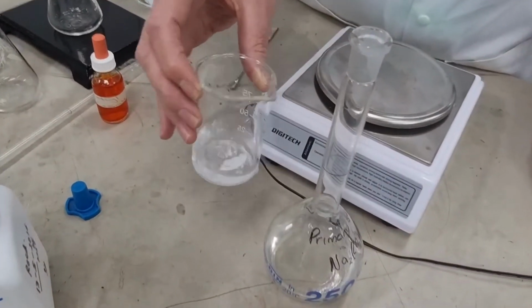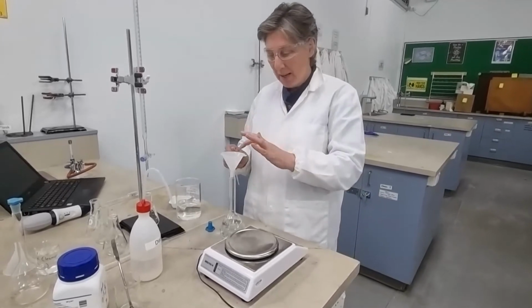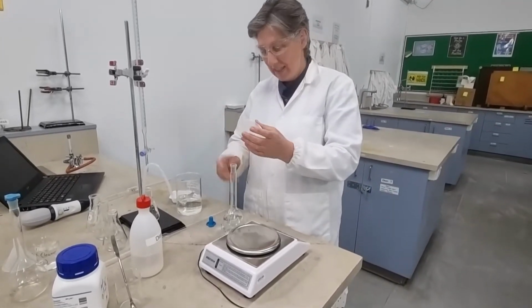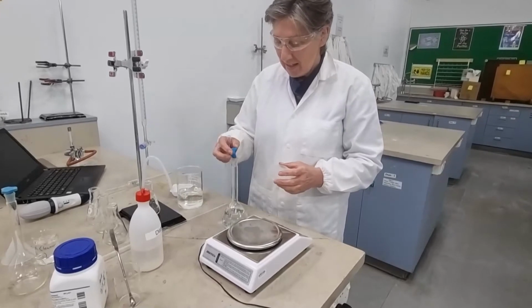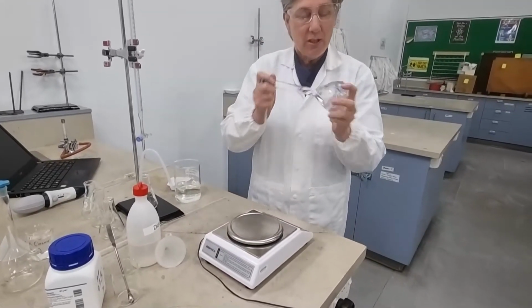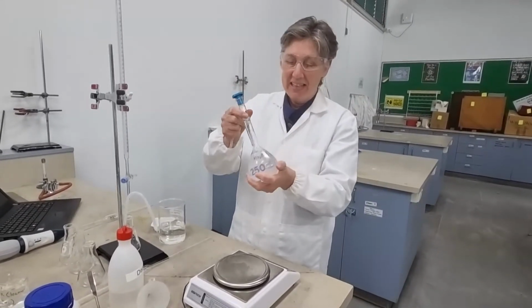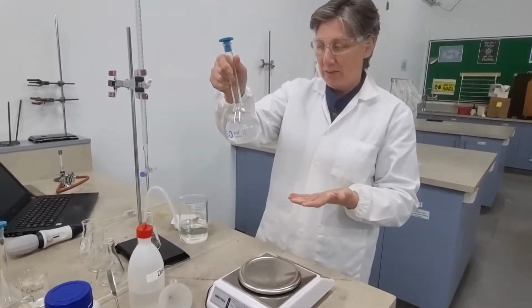So I might stop videotaping. All right, Miss just mentioned that she actually puts the powder in here first, then rinses it out into there, and then in order to make it dissolve faster, what she did was shake it up like this, which was much better. Okay, so then we shook it all up and it dissolved actually quite quickly.